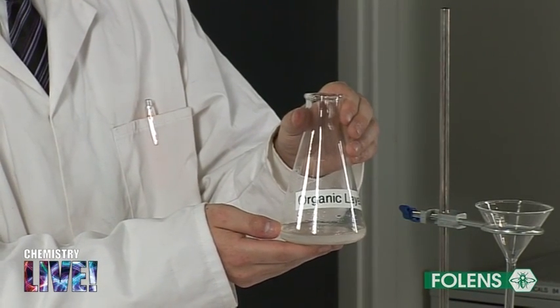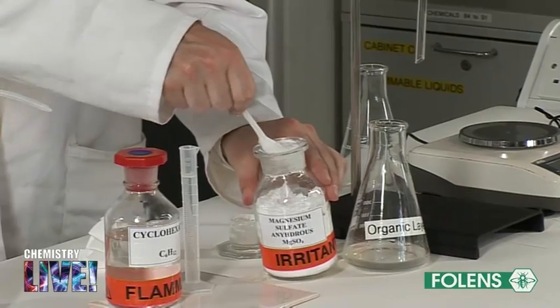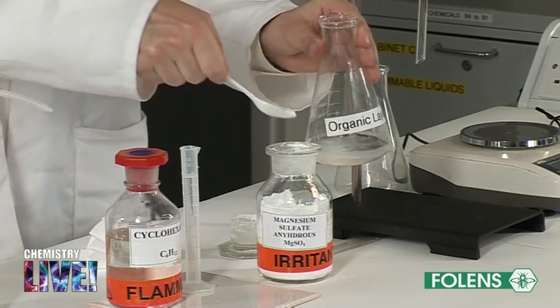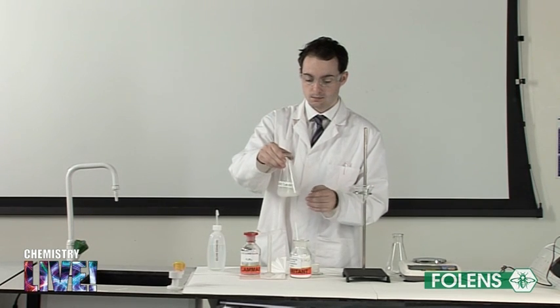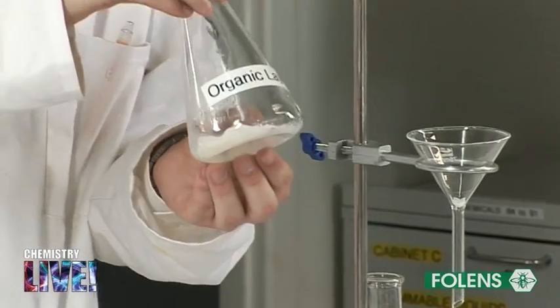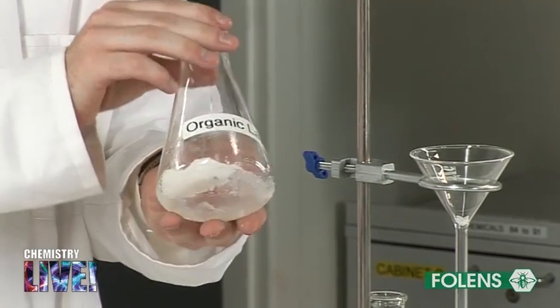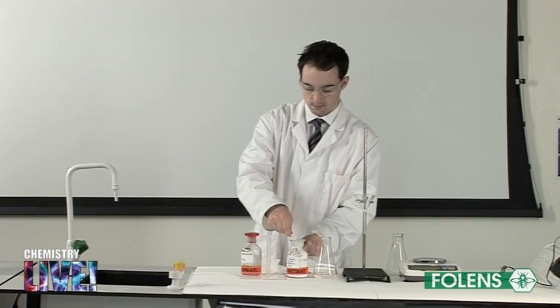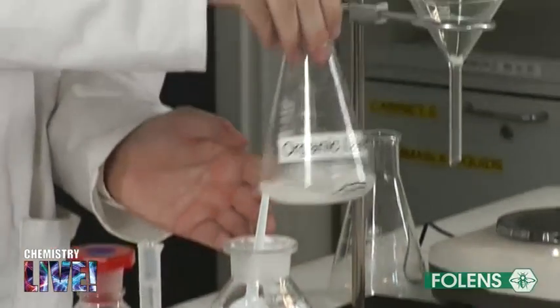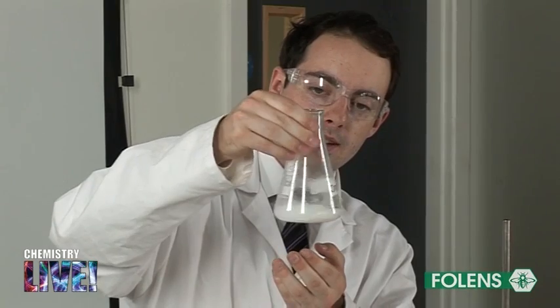Using a spatula, add anhydrous magnesium sulfate in small quantities to the cyclohexane solution in the conical flask. Swirl the conical flask between each addition. You will notice at first that the magnesium sulfate will form clumps that stick to the sides and bottom of the flask where it comes in contact with the water present in the conical flask. Continue adding the anhydrous magnesium sulfate until the powder settles at the bottom of the flask as a fine powder without forming clumps. Do not worry about adding too much anhydrous magnesium sulfate, as this will be filtered off at a later stage.